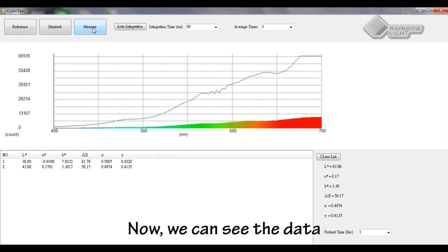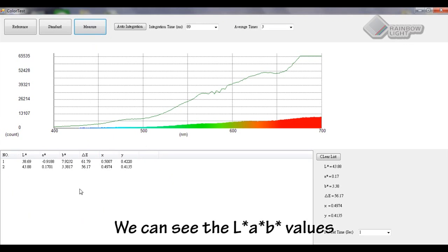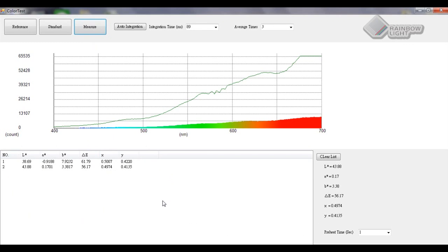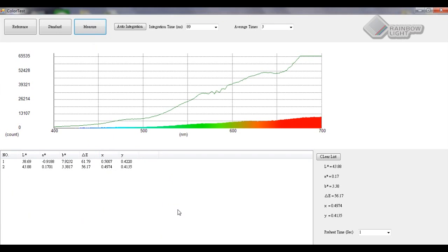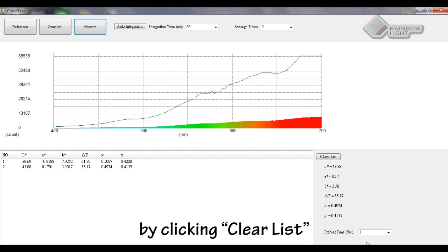Now we can see the data will be shown over here. We can see the LAB value with two different data sets, and we can also delete measured data by clicking clear list.